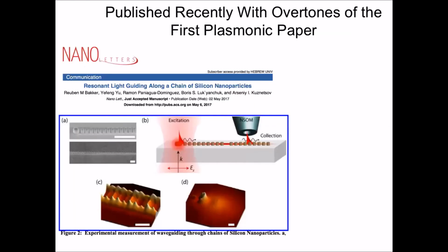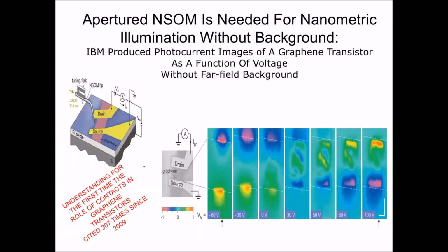This is another paper done with silicon nanoparticles and the same methodology. I won't go into it, also with Nanonics. This is a very interesting application of illumination. Basically, it was done by IBM with our system. It may have many, many more citations now.